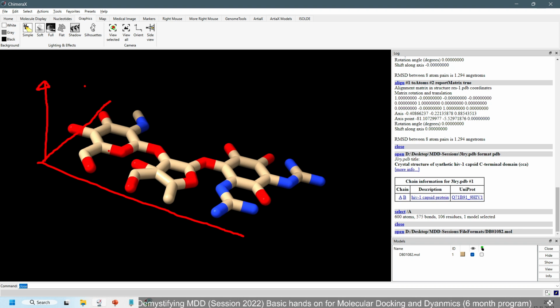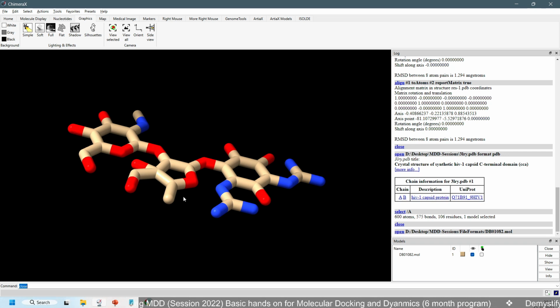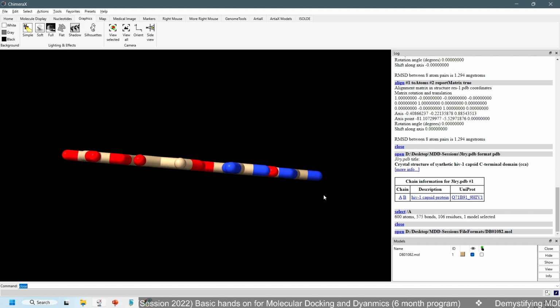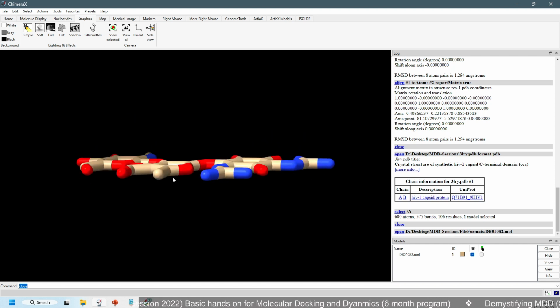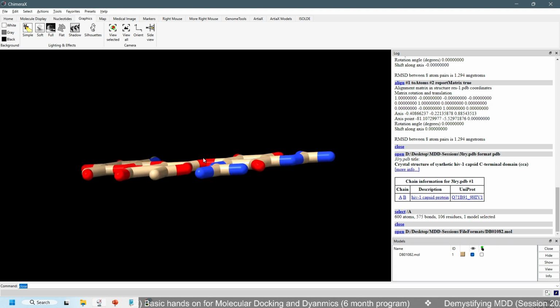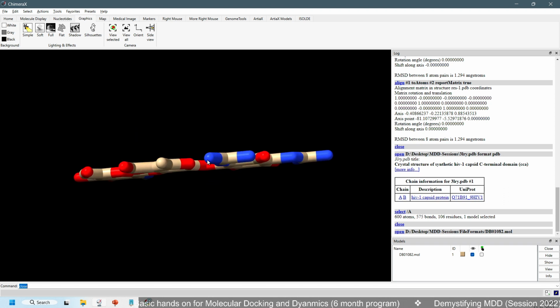You are seeing the height of the structure, meaning the bonds, but it is just a representation to make it clearly visual to you. This is not a 3D structure. If we view from the third dimension, aligned on the z axis, we will see it as flat. So this is a two-dimensional structure, and earlier we opened some protein structures. We can rotate on the z axis and have visualization from different axes or angles. The protein you have already observed is a three-dimensional structure.